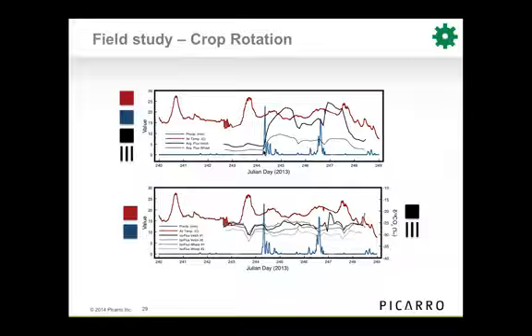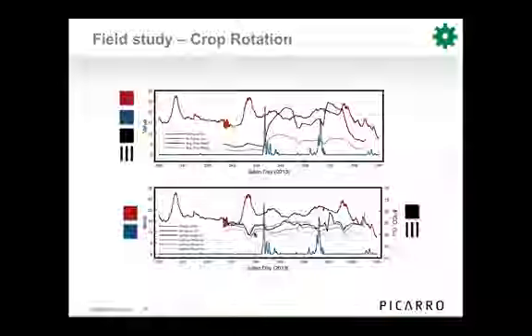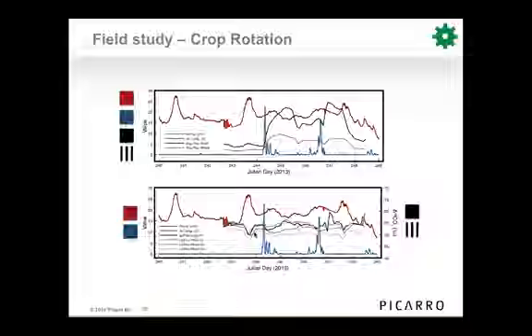On the bottom here you have the isotopic flux, and we weren't really able to observe a huge temporal trend in that, which we were hoping. But what we were able to pick apart is that the isoflux from the wheat tends to be more isotopically depleted. So it tends to use more 12CO2 than the flux from the vetch site.